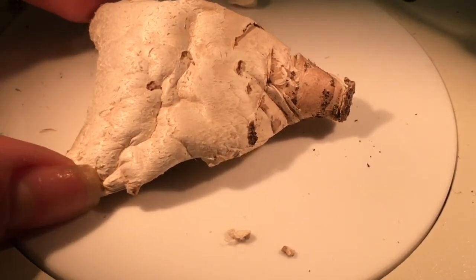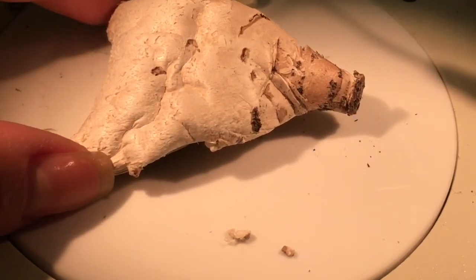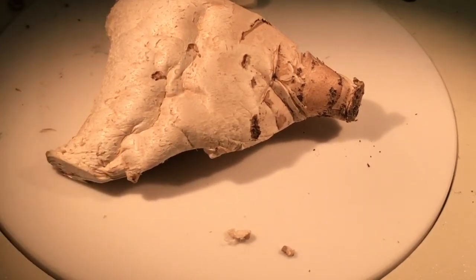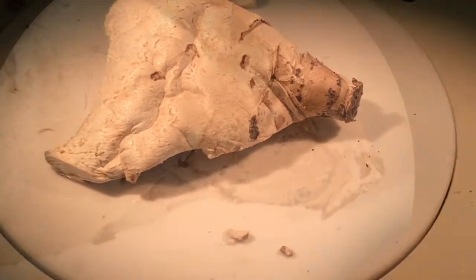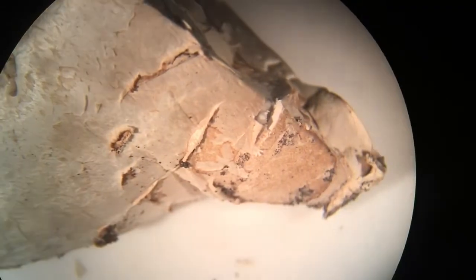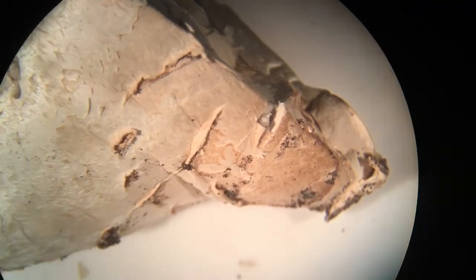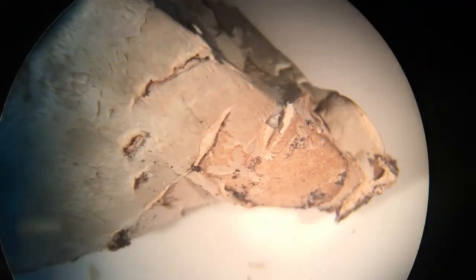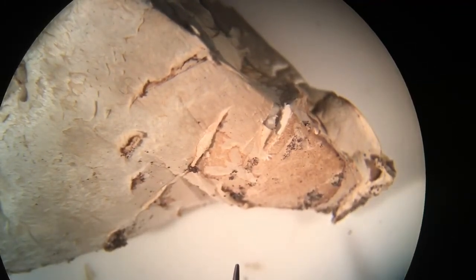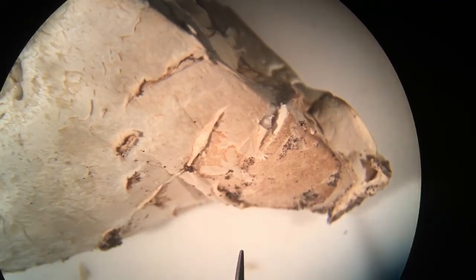And hopefully what I show you will help you get successful hand sections that will show you what you need to see under the microscope. So the first thing that you would do, if you have a hand lens, great, use a 10x hand lens to view your specimen closely. If you have a dissecting scope or stereoscope, even better. And you're going to inspect the textural differences all throughout the cap to help you see if there is actually, in fact, any universal veil remnants or not.